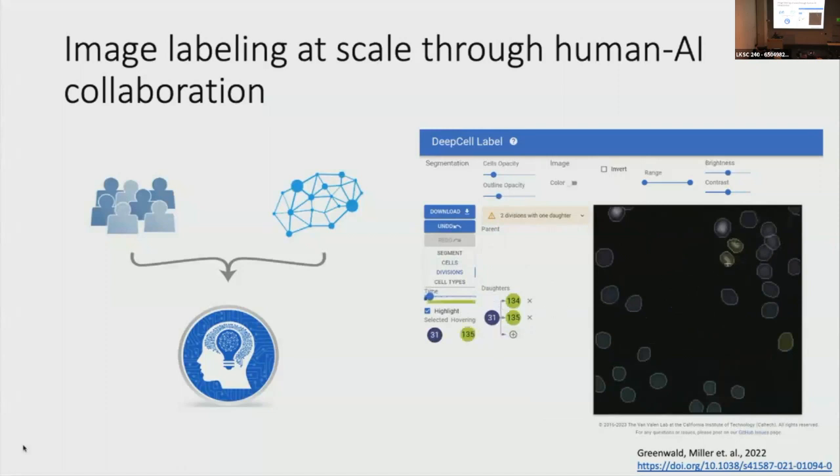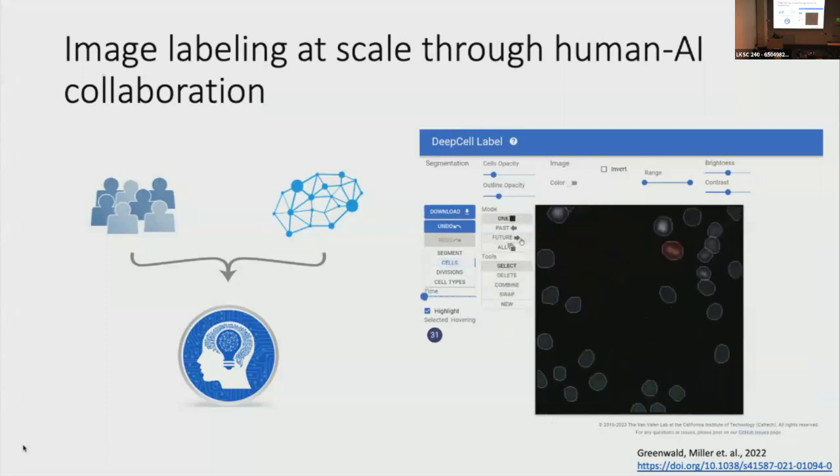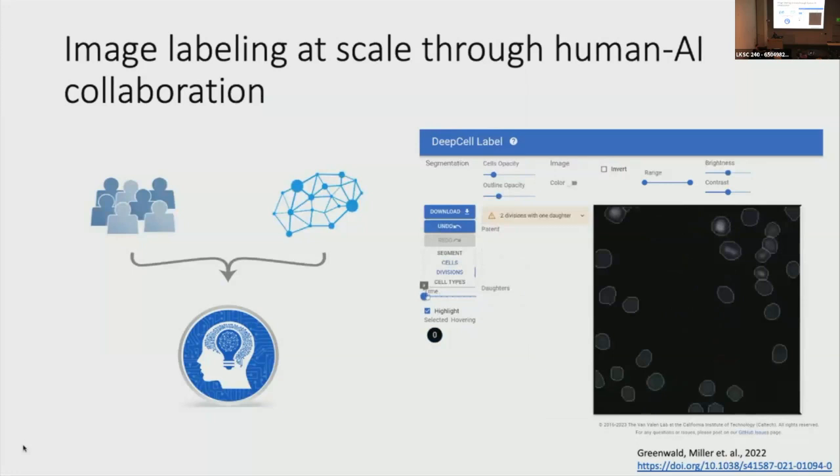And so we built this software system, Deep Cell Label, that lets us do labeling of large data sets in a distributed way. The key thing here is that this is browser native and also scales as your user base scales. So if you have one data set, a dozen, 1,000, you can still have the same sets of people. And this can be used for both crowdsourced workers who have less skill, and then also expert workers who are more the PhD and potentially MD variety as well.